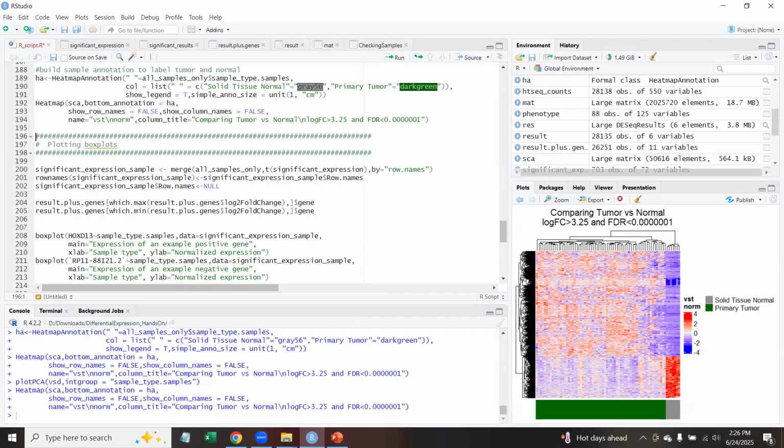Oh, there's a comment. Yeah, if we subset the genes more strictly, this plot might be clearer, even more striking. I did this this morning with the high school students, and I limited it to the 7 samples that have both tumor and normal. And that heat map was beautiful. The genes were really strongly red or blue, and it gave us really clear signals on the heat map.